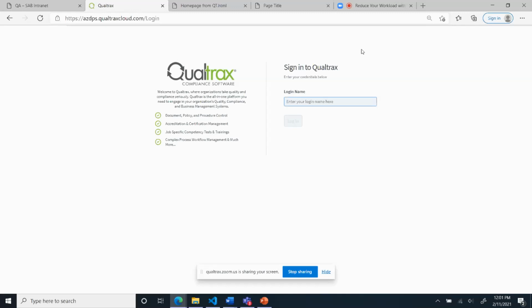I think that when we first got Qualtrax, there was the option of customizing your homepage. I think in the user's manual, it was a bread company that they showed, and that was really cool for us. But the file was on the server side. We didn't have access to the server side, and it just didn't really work out for us. And so we put together a really clunky web page that was kind of a landing page for us, and that's what we used for years.